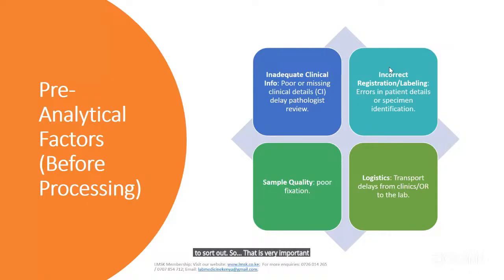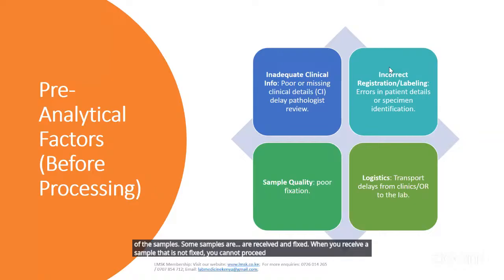Then another thing is the quality of the samples. Some samples are received already fixed. When you receive a sample that is not fixed, you cannot proceed to grossing and processing. You will have to give it another day to fix.